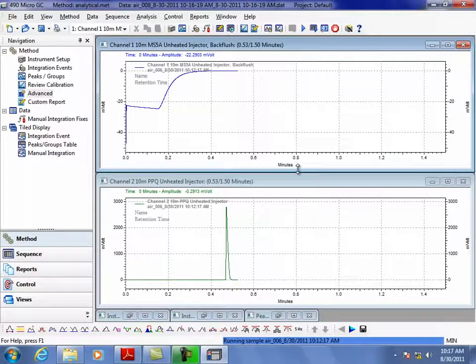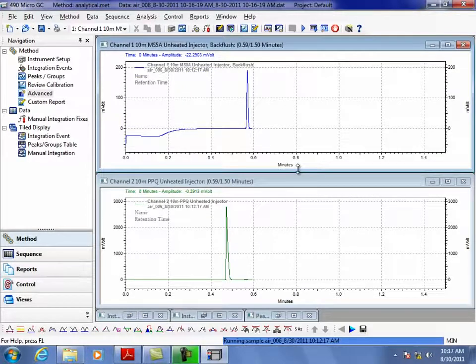And I get asked that question a lot. Well, how do you know that's what it is? Well, I look at these columns a lot. It's pretty obvious to me what it is, but it's not to somebody who just walks up and looks at it. So I go through and name it, and in the future, you'll know the elution order. So if things shift, they don't shift out of the elution order. If this changes, like if this column gets wet, these two don't flip. They just all fall forward. So the elution order is the same.